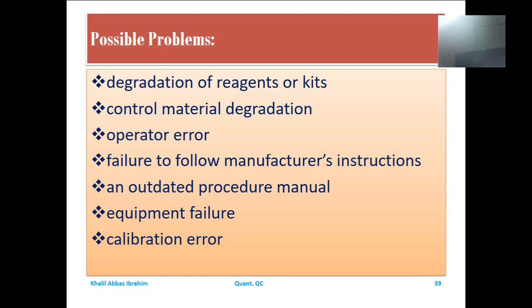Failure of equipment and technologies in the laboratory indicates a lack of a system of equipment or technology management. If there is equipment management, prompt failure or accidental failure will rarely take place in the laboratory, so it is very necessary to manage well the technologies used in the laboratory so as to achieve quality of the services.